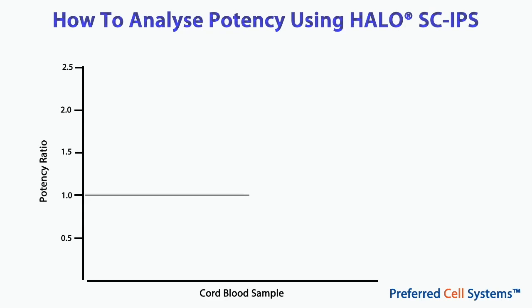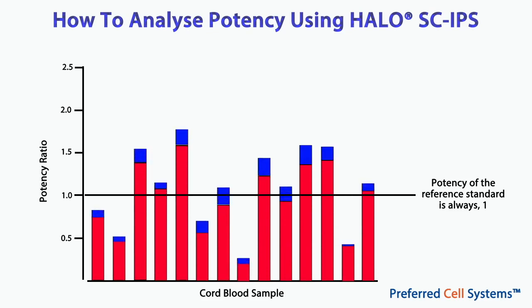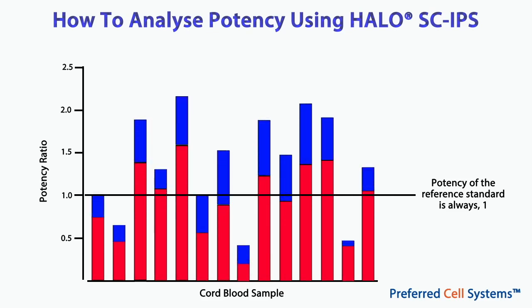The first thing to know is that the potency of the reference standard is always 1. If the potency ratio is less than 1, the potency of the sample is lower than that of the reference standard, and a greater number of cells will be required to produce the same response as the reference standard. Conversely, if the potency ratio is greater than 1, the potency of the sample is greater than that of the reference standard, and fewer cells will be required to produce the same response as the reference standard.